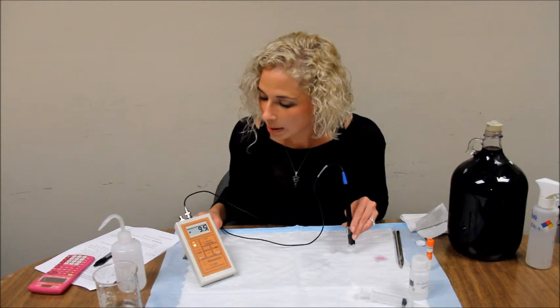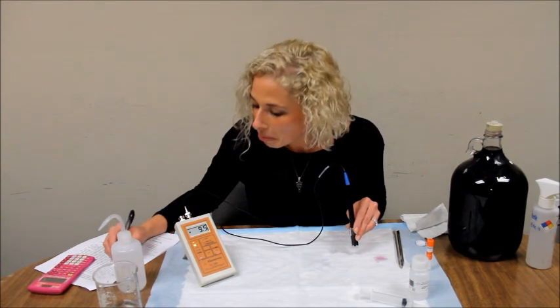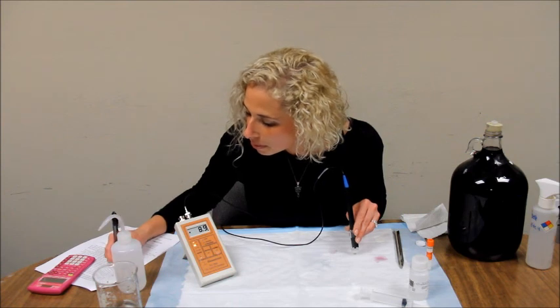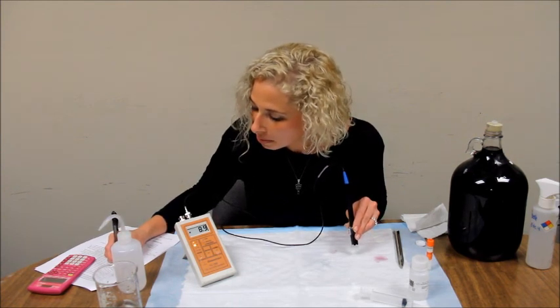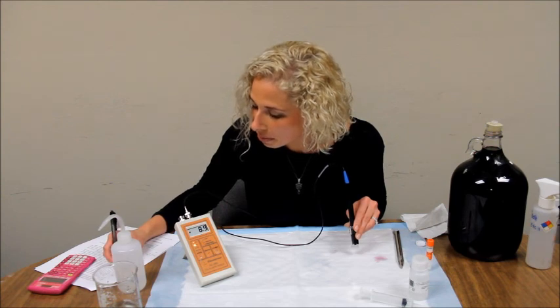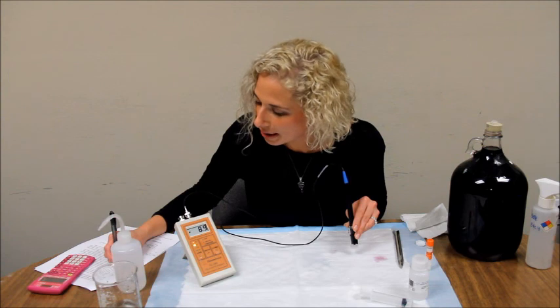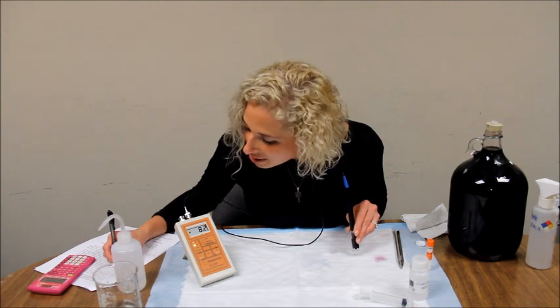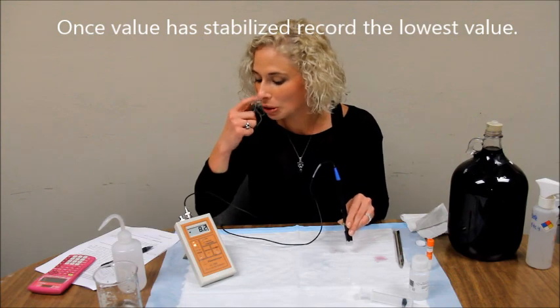The reading has stabilized at a value of 8.9. Go ahead and record this value.